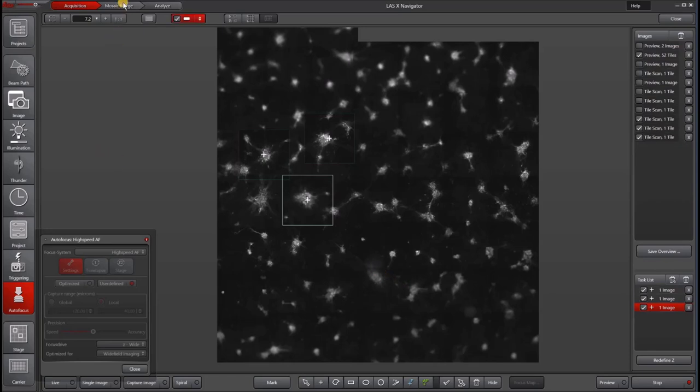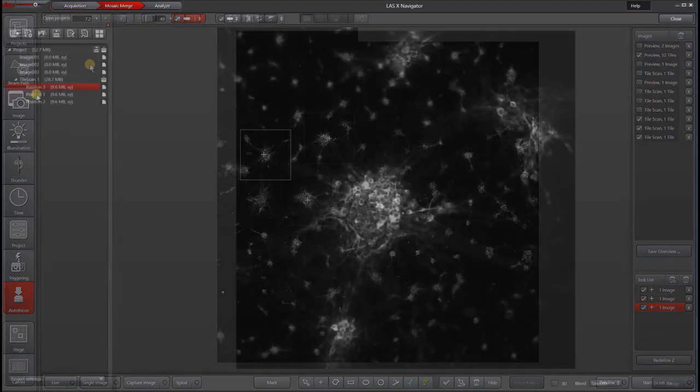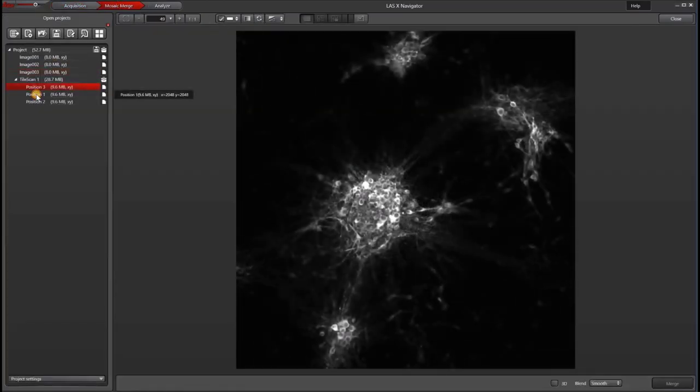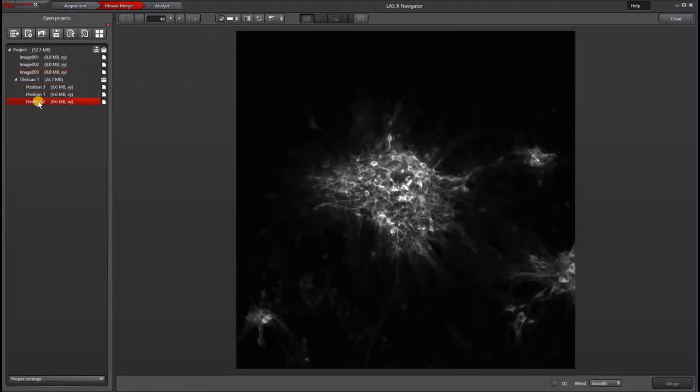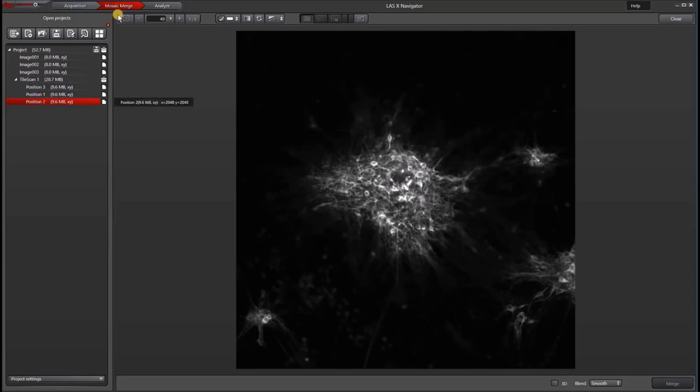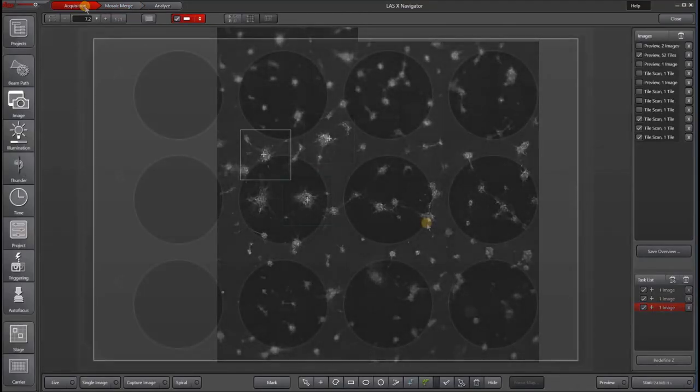You can see that the autofocus did a pretty nice job of finding the focus and taking an image at each of those positions.